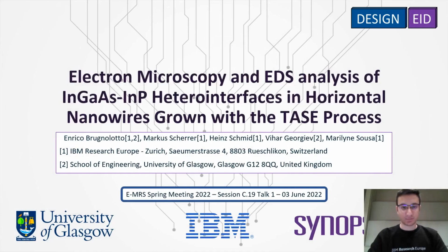I'm Enrico Brugnolotto and today I will be talking to you about our analysis carried out with electron microscopy and energy dispersive X-ray spectroscopy of indium gallium arsenide indium phosphide heterostructures grown using TASE in horizontal nanowires.